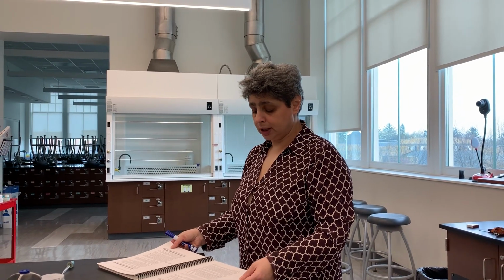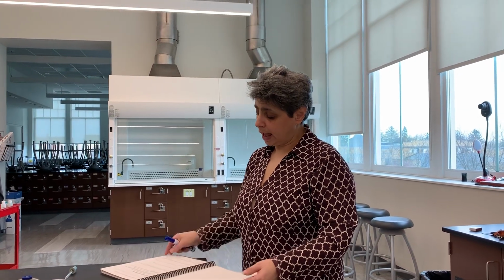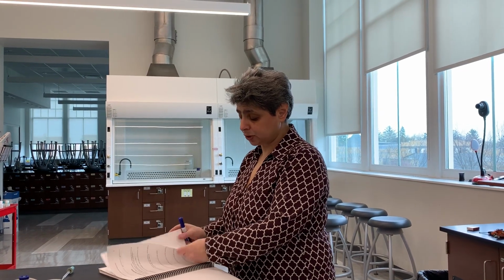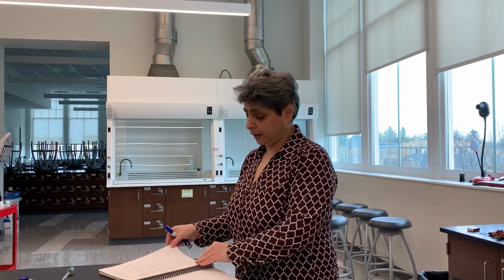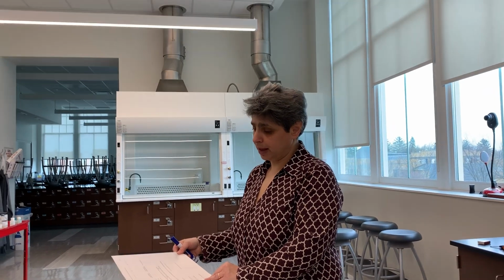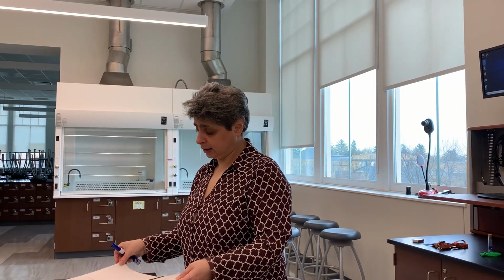So we're now looking at part 1 of the procedure, studying half cell potentials. And like I said, you will not have to complete the post lab simply because you have not done this in lecture yet. But I think after watching these videos that I'm trying to make very clear for you, you should be able to complete data sheet 1 and data sheet 2.